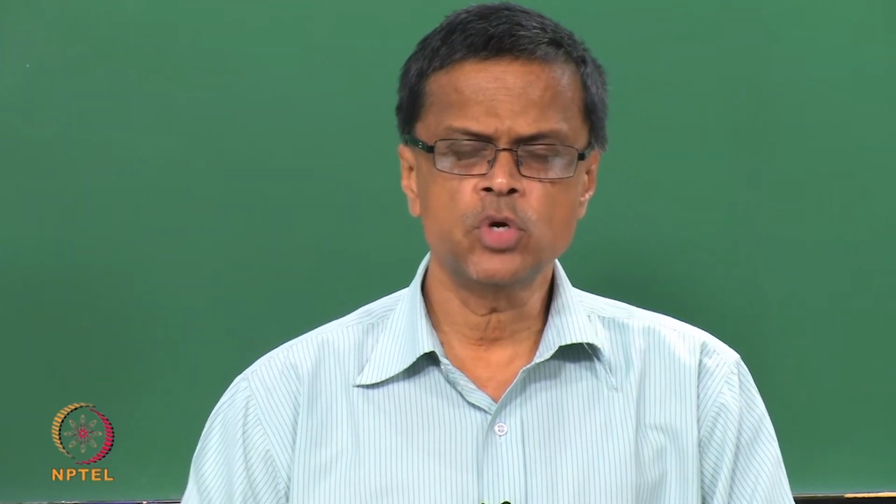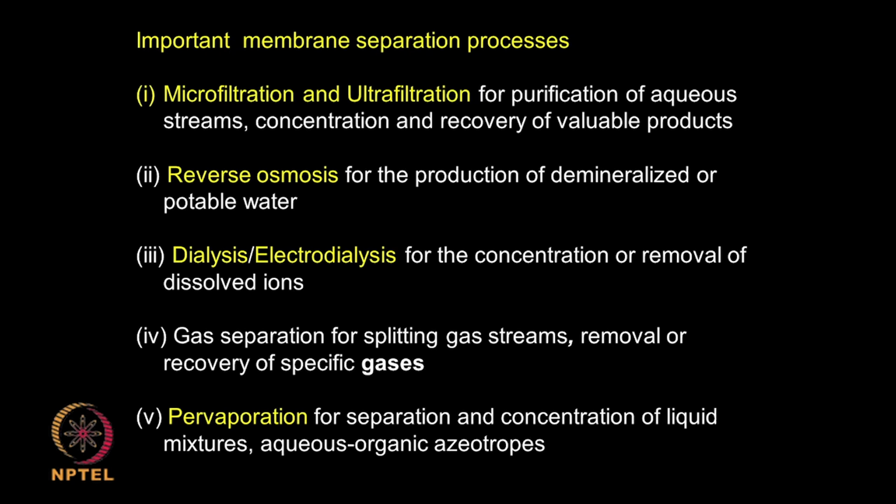Class, we are going to talk about membranes, and I am going to take 2 classes on membranes because there are different types of membranes, a large variety of membranes that are used. They act as filters, they act as separating liquids, they act as separating proteins and so on. So, different types of membranes each using different principles of operation. So, what are the different types of membranes, especially the important ones that are used for separation?